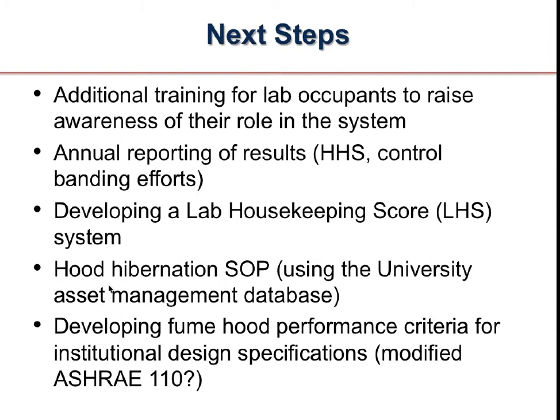I would like to have institutional design specifications for the designers to have, that when they go to choose a fume hood to put into some new construction or renovation, I don't have to worry that they went to the specific manufacturers that they are allowed. I want the hoods that they choose to perform to certain criteria.